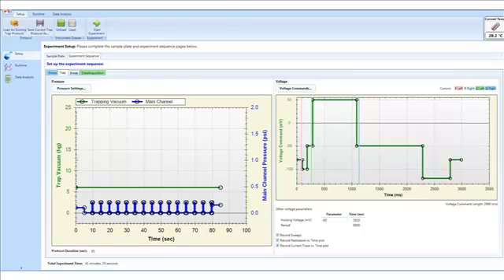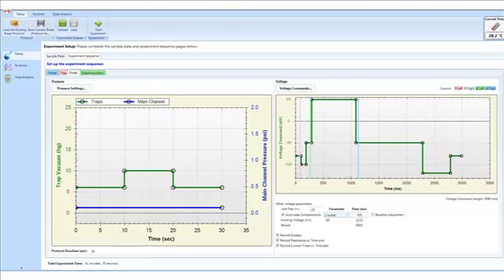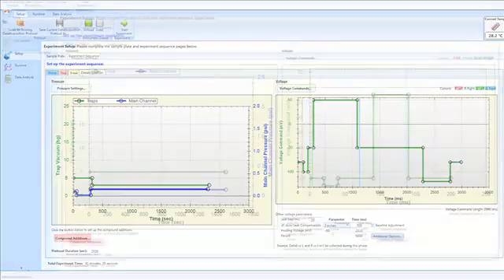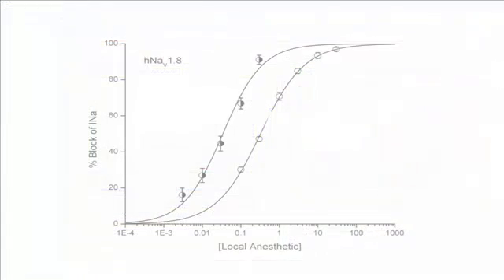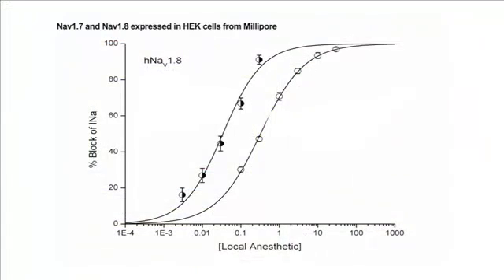In this assay, the sodium channel expressed in HEK293 cells was activated by voltage clamp steps from minus 120 millivolts to zero millivolts applied every second. This protocol therefore provides information on tonic block of the channel, since the channel re-enters the rested state between depolarizations.